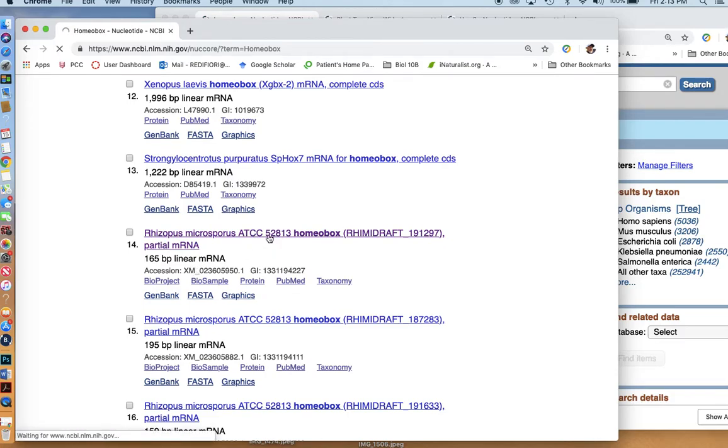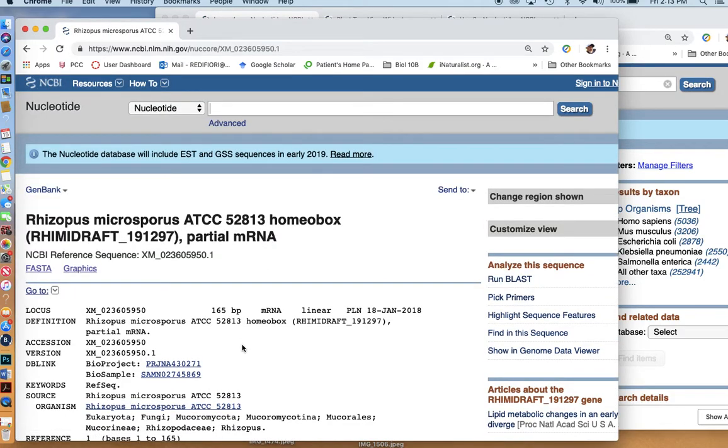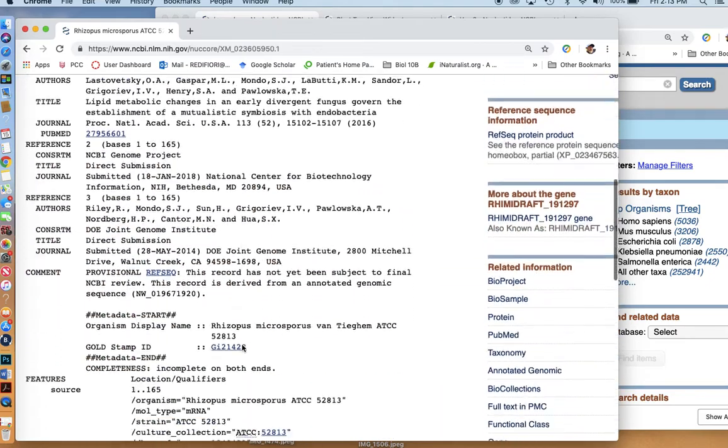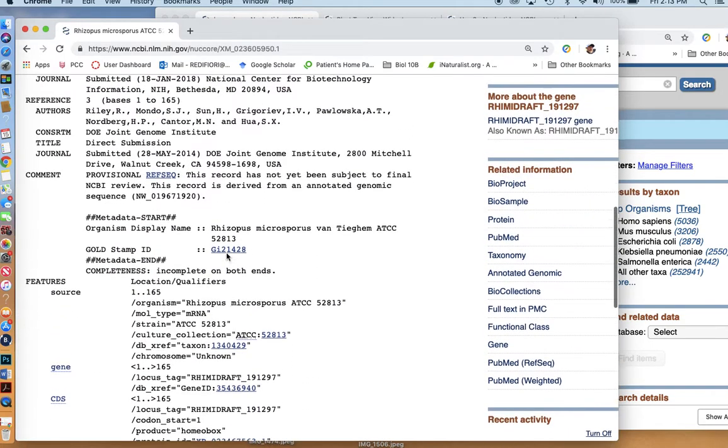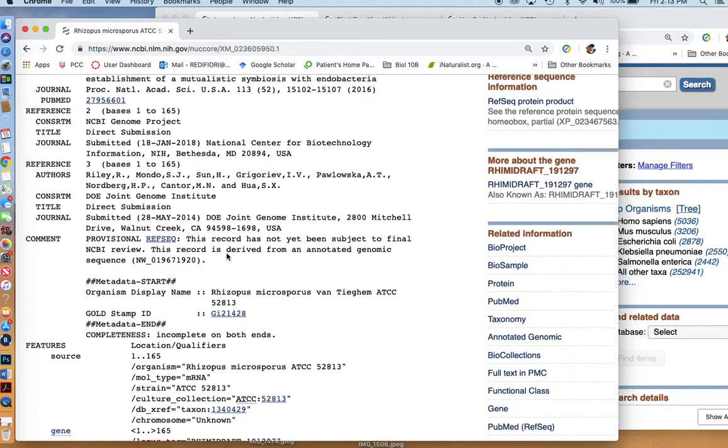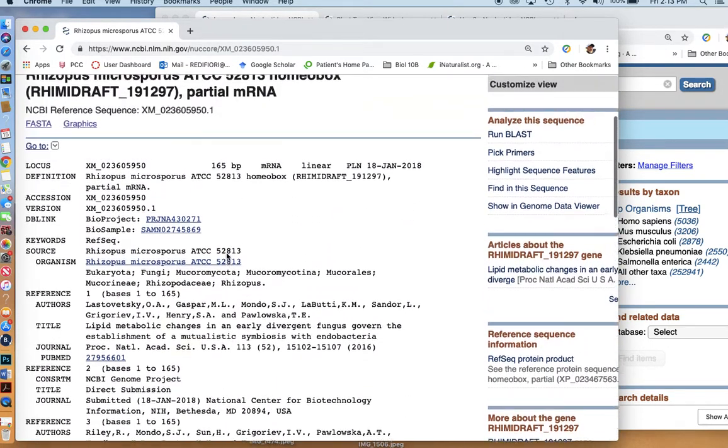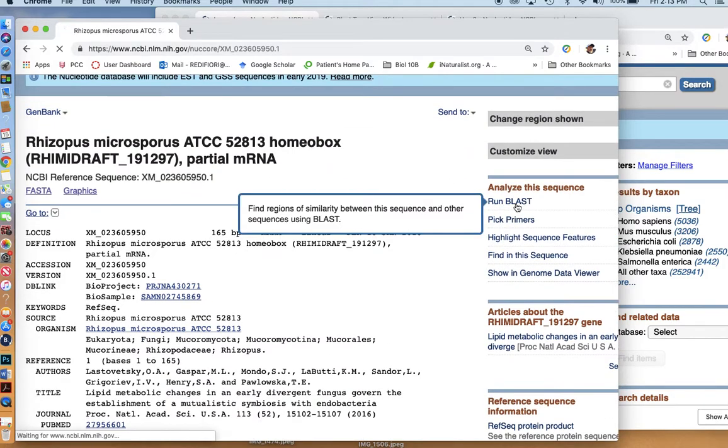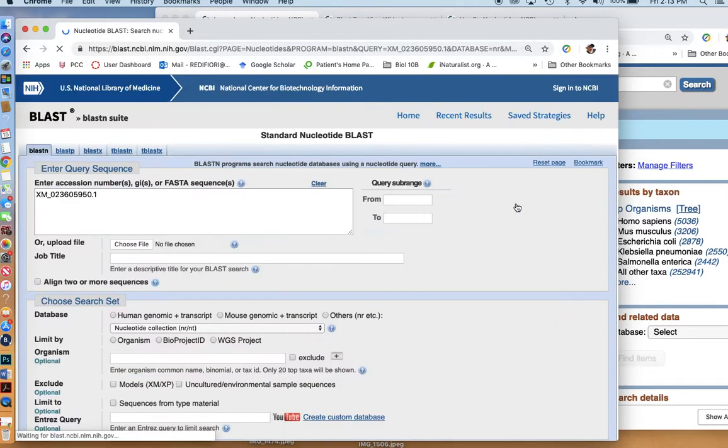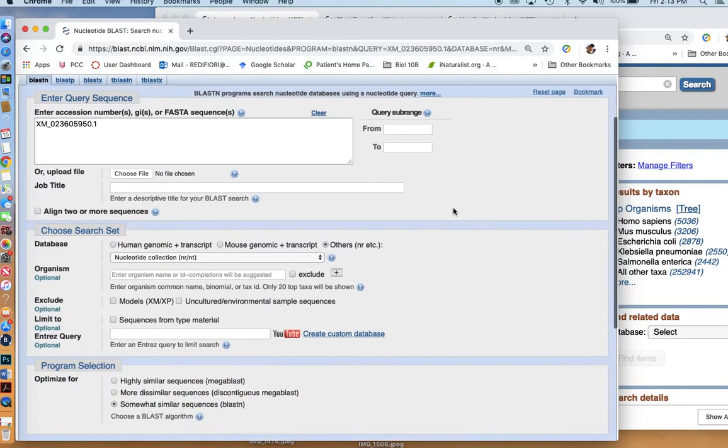So I'm going to click on it, and it's going to give me the little sequence code and the whole reference to that. And I don't have to do anything else except go right over to run blast, and I can start to make a comparison.